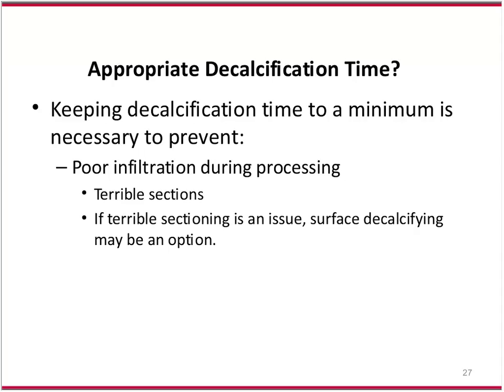Because if you aren't rinsing the ammonium hydroxide off your sample, you're dropping the pH substantially, and then your stains are going to be off, because you're taking your sections from ammonium hydroxide to water to the microtome. And if you don't rinse it well enough, you're also contaminating your water bath, putting it on the slides. When you send your slides to be stained, you're going to see a whole lot of variability in the slides and the stains because of the surface decal. And like I said, I'm not a big fan, but sometimes that's the only thing you can do.